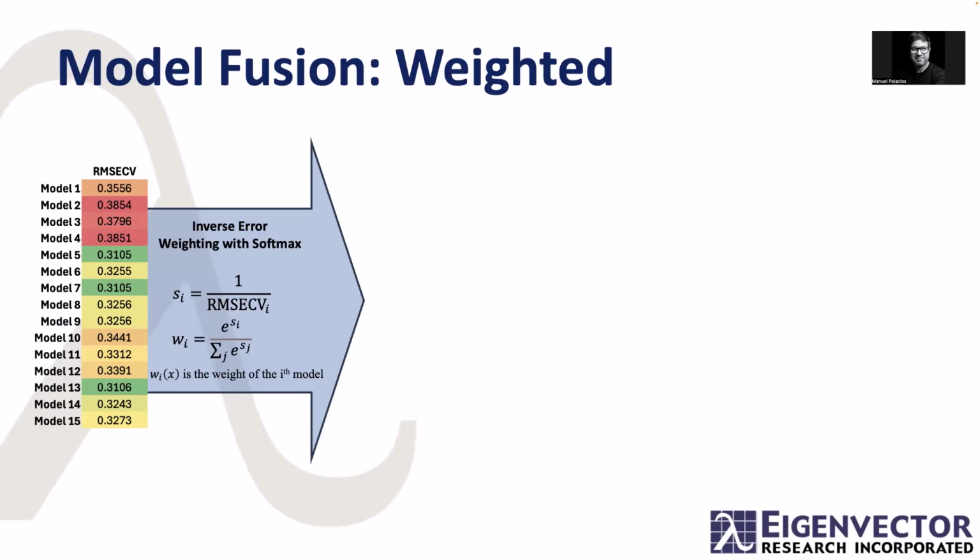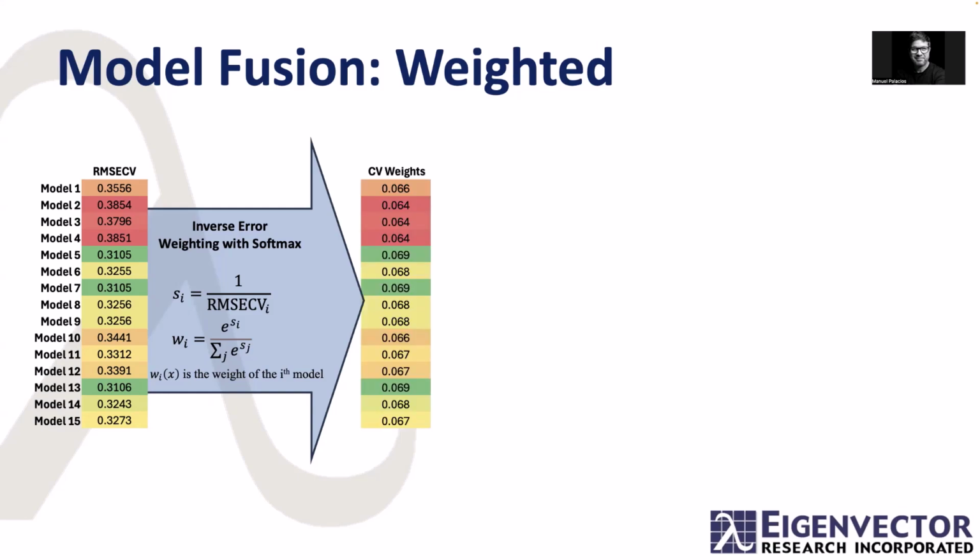The whole reason is that we know the outputs of these models are going to be very close, since these are all the best performing models for a certain problem. So in order to actually make a difference, I prefer to normalize with softmax, which emphasizes the differences between those models. A regular normalization would work too, but it might not pick up the nuance.